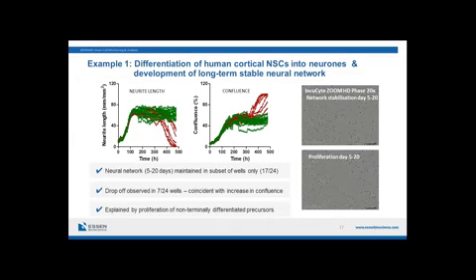Okay, now this is where it got interesting. When we continued to monitor these cells, what we noticed was after about 300 hours in culture, in a number of the wells, we began to see this deterioration and a drop-off in the total neurite length. And I've separated these wells out and color-coded them red. So in 7 of the 24 wells, we began to see this deterioration phenotype, which we weren't expecting.